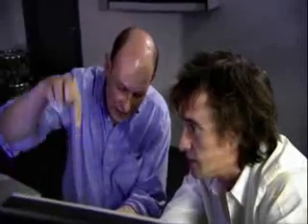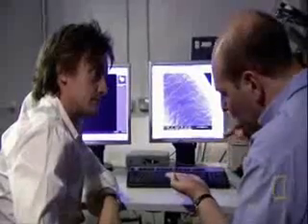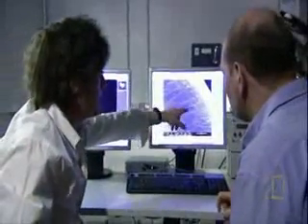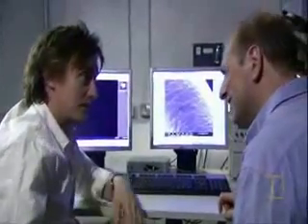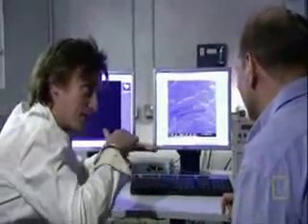And how do you use that for polishing? Well, here we're coming down vertically onto the surface so that we blast away a pattern on the surface. If we wanted to polish something very smooth, then we'd fire those ions in at a very low angle to the surface, so that they just knock away high spots on the surface and leave something that's very, very smooth. So this process that can etch my name lost in the width of a hair — you're saying is heavy duty. And if you want real finesse and polish, you send it in at a more acute angle rather than perpendicular. It's heavy engineering, but on a very, very small scale — atom by atom.